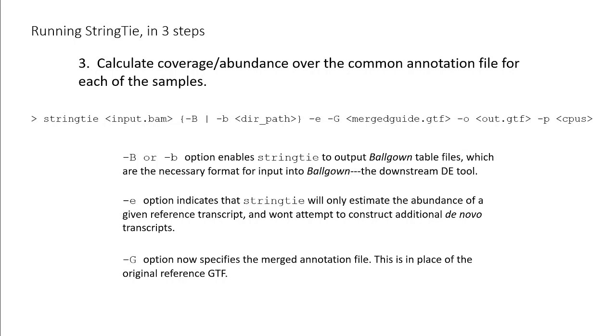For each of these 3 steps, there are many more options that can tailor the Stringtie output. Here we've only discussed the minimum requirements.